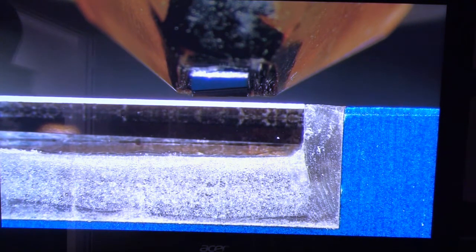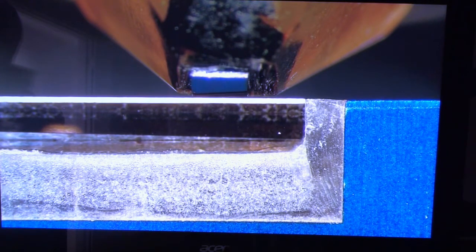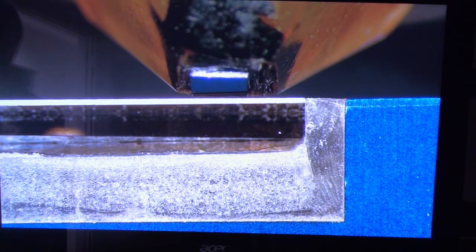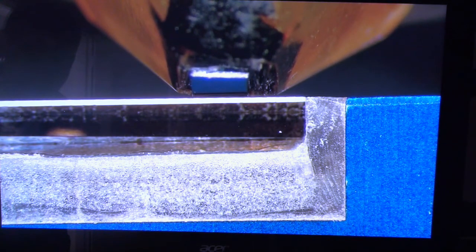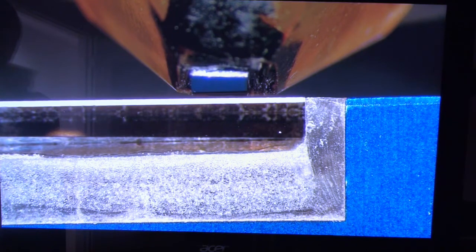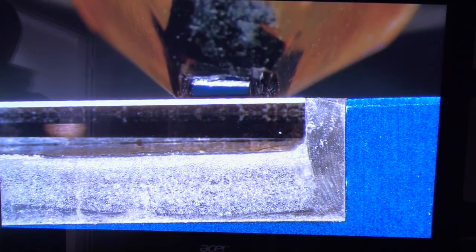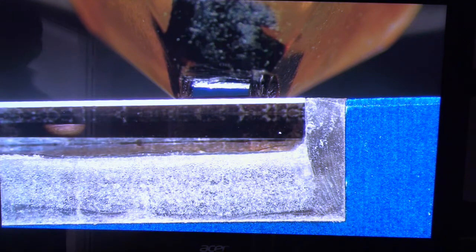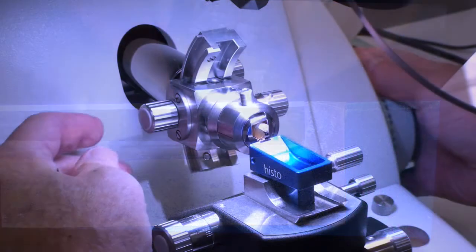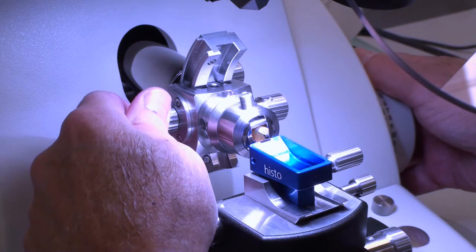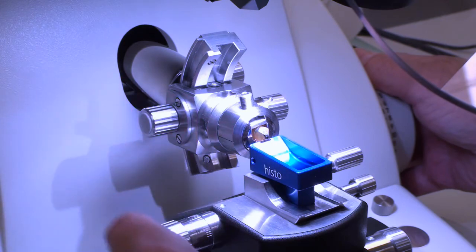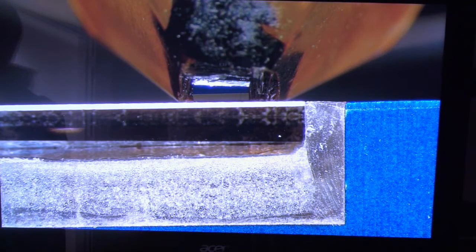Now be careful. You can see that as you change your knife arc it may start to hit into the sample. So you have to back up using the manual retraction. And get that so that our reflection or the proximity of the knife to our block face is pretty even across there. Now as I go up and down I'm going to be paying attention to that reflection because it's going to show me that right now the top of the block is closer than the bottom of the block. And you can see that due to the thickness of the reflection.